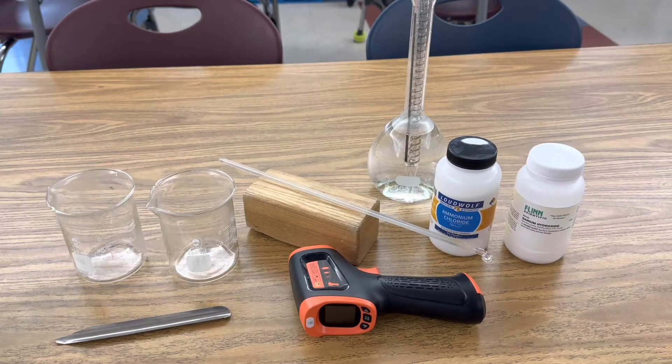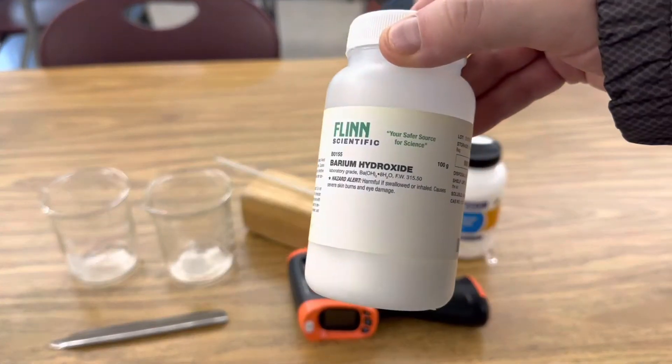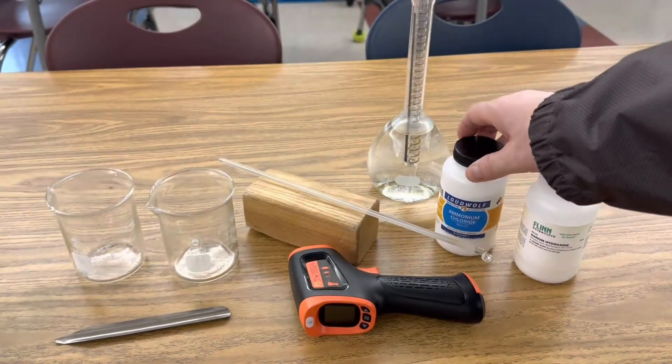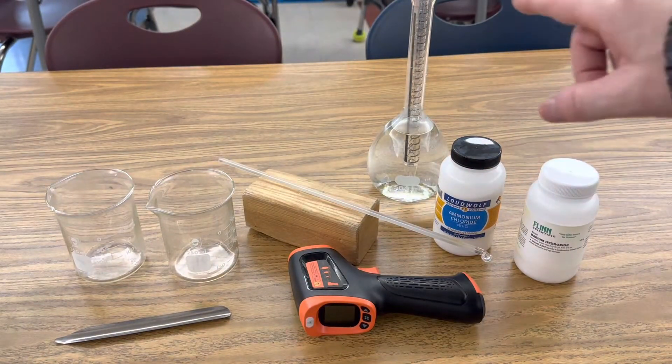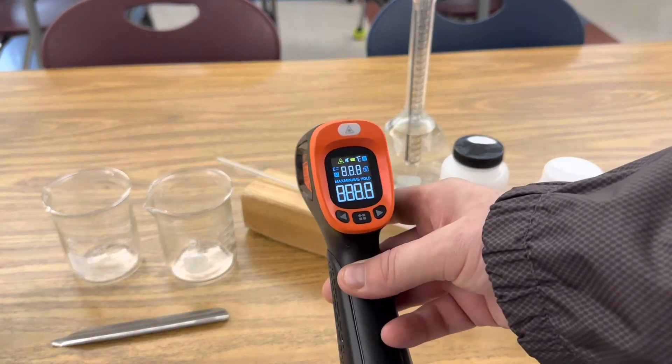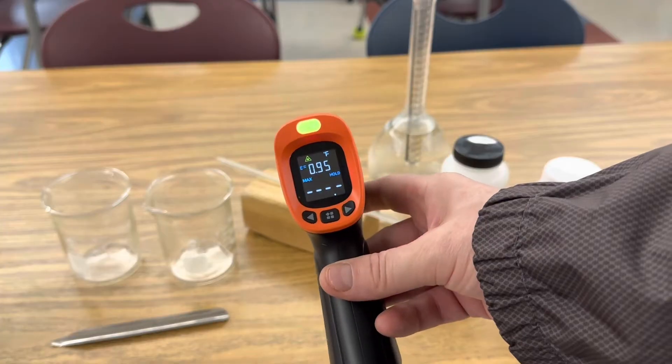All I'm using in this investigation is barium hydroxide, ammonium chloride, a 500 milliliter volumetric flask with some water and a dropper, and an infrared thermometer just to check the temperature during this endothermic reaction.